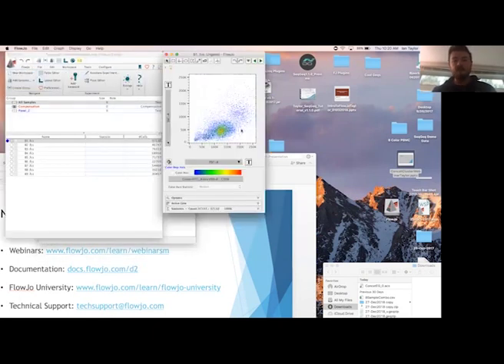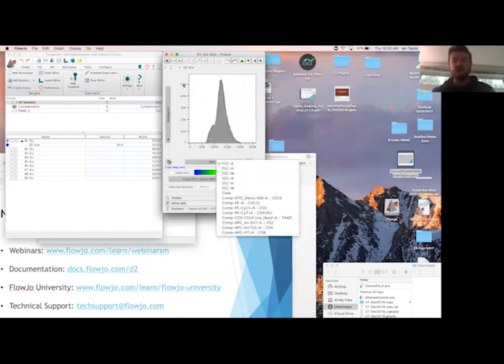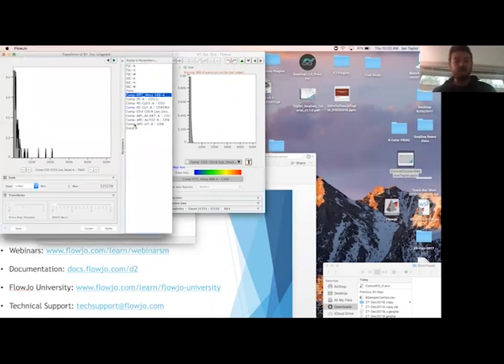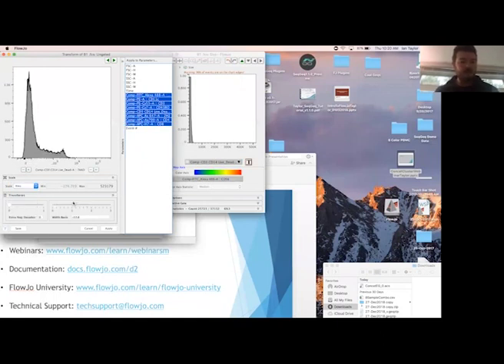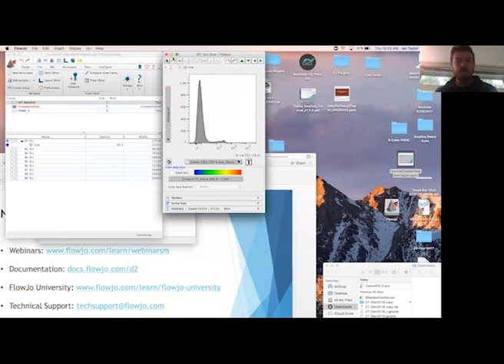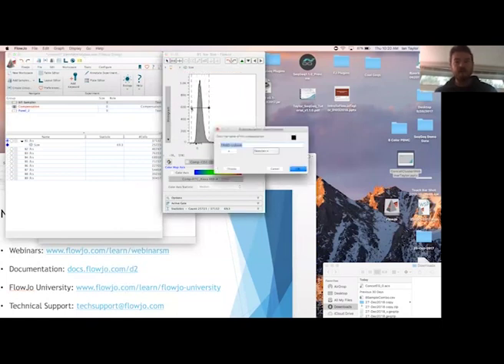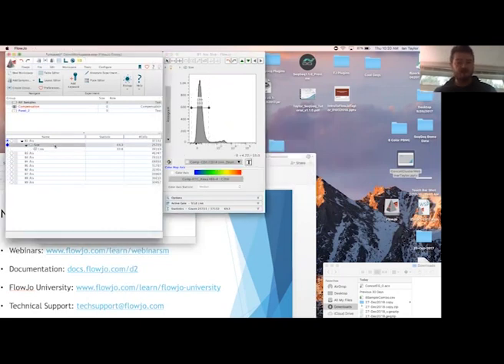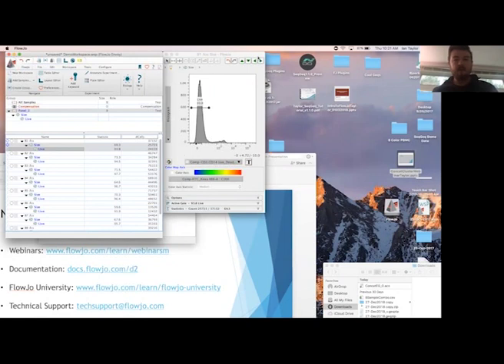So here, maybe this is our size gate of interest. From there, I'll look at a histogram for live dead. It looks like our scaling is already off. So I'll go ahead and rescale all of these compensated parameters like so. And maybe by X, that width basis looks a little bit large to me. Okay with that. Here's our live events. And if I hold down Alt, I can just drag this up to our group. Now those have been applied for all.